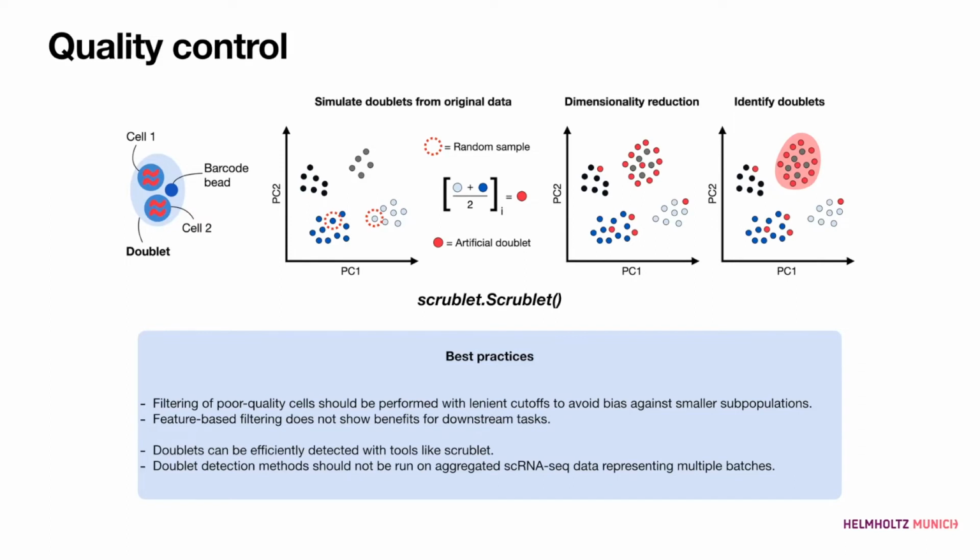Essentially, this results in cells that might have a slightly higher number of counts, but at least if you're using 10x, this is not necessarily the case because you have a fixed number of counts that you can get overall, I think, or something like this. So this is not a linear relationship, so you need some more advanced methods to really robustly identify these doublets.